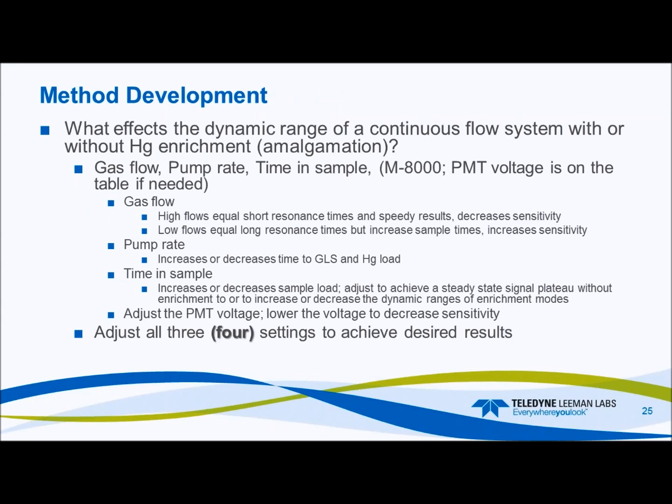So what affects continuous flow with or without Hg enrichment or amalgamation? So you have your gas flow, your pump rate, your time in sample, and in our case, we have the ability to set the PMT voltage. So that's on the table if needed.